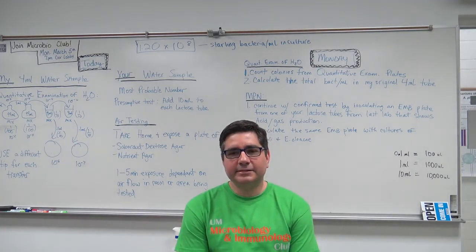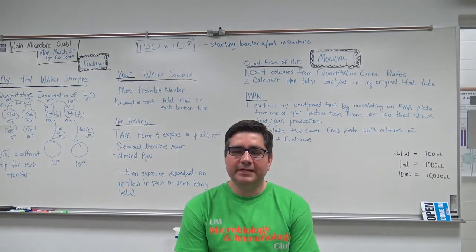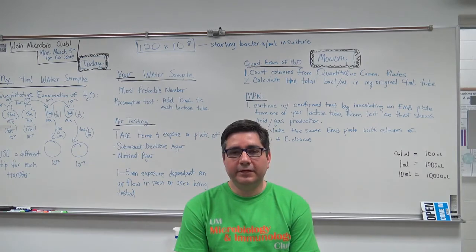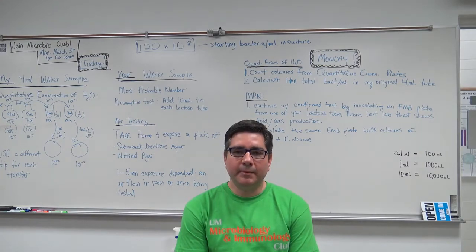The completed test would then involve placing the organism on a new slant, as well as inoculating another lactose tube and getting acid and gas once again. We have included the prepared cultures in the sections of the plate so that you can compare your sample to a positive and negative control.